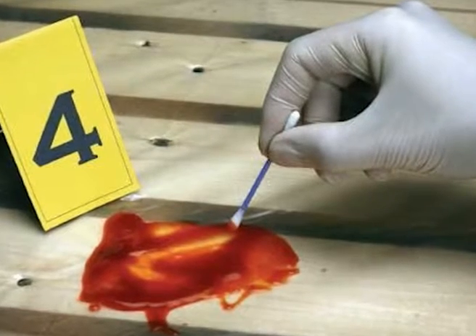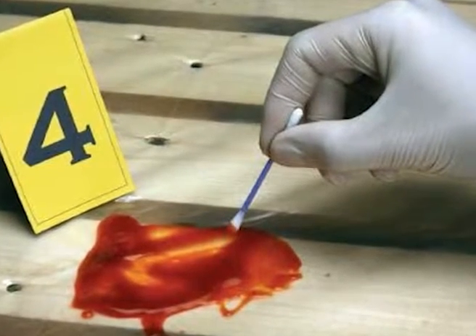However, if a blood coated finger touches a surface repeatedly, the impression gets weaker and weaker, or it may get fainter and fainter. Under these circumstances, it is pertinent to enhance the impression with the aid of a suitable chemical reagent so as to make the ridge detail clearer and sharper.